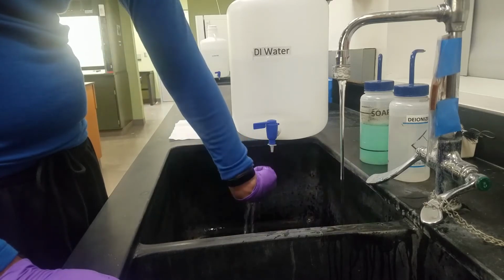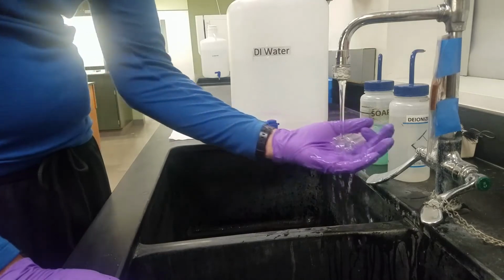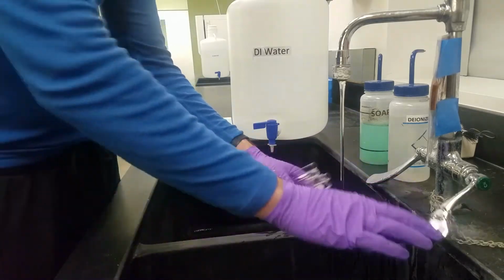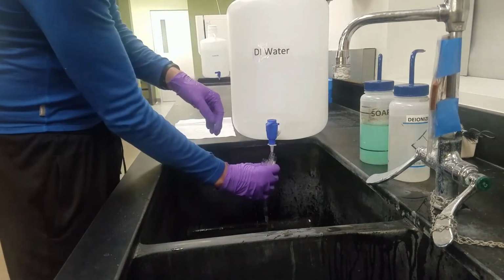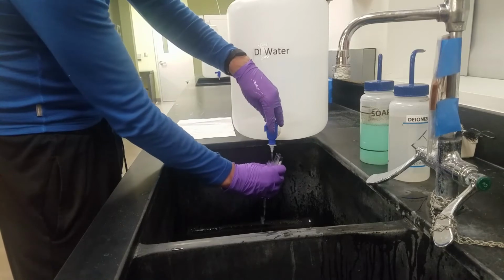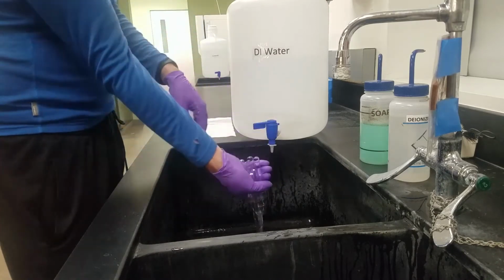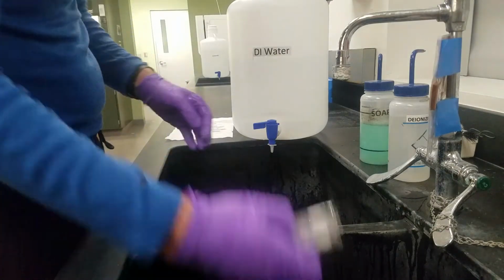So these would now be kind of officially clean. However, tap water is dirty inherently. So what do we want to do? We want to make sure we give our glassware a quick rinse with the deionized water. Again, generally I like 2 rinses just to make sure we've reduced and removed the majority of the ions that came from our tap water. We can now set them out to dry.